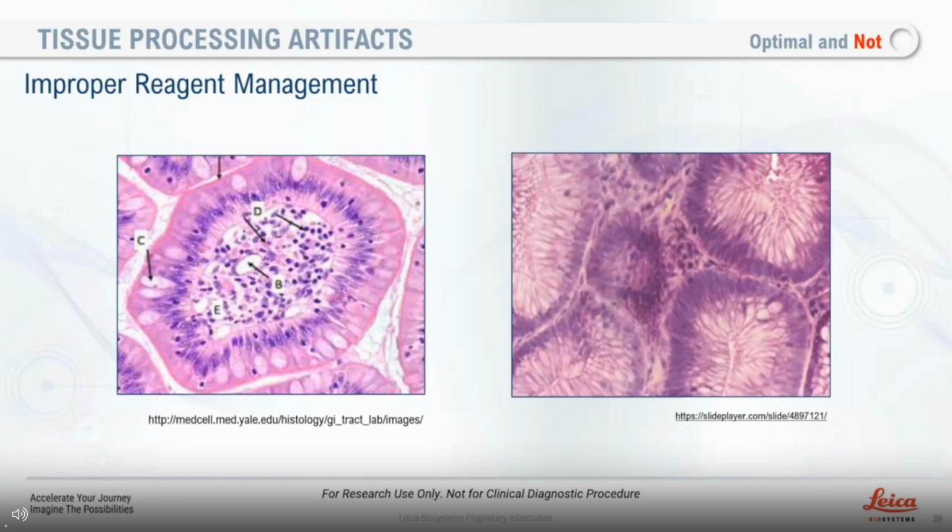Next question. Why would paraffin crumble when cutting? Is it due to humidity or because of the embedding reason? I don't know that humidity would be a factor, but if it's crumbling, sometimes it depends.